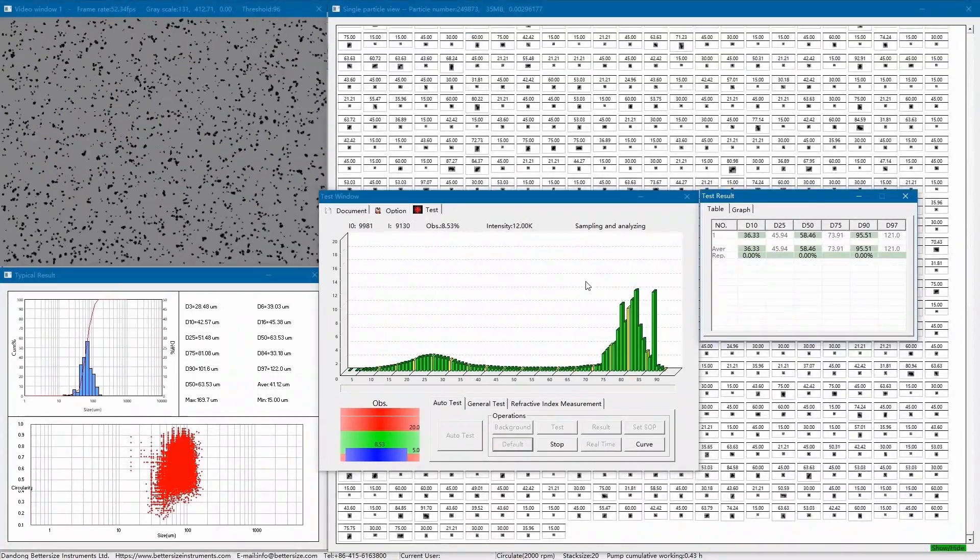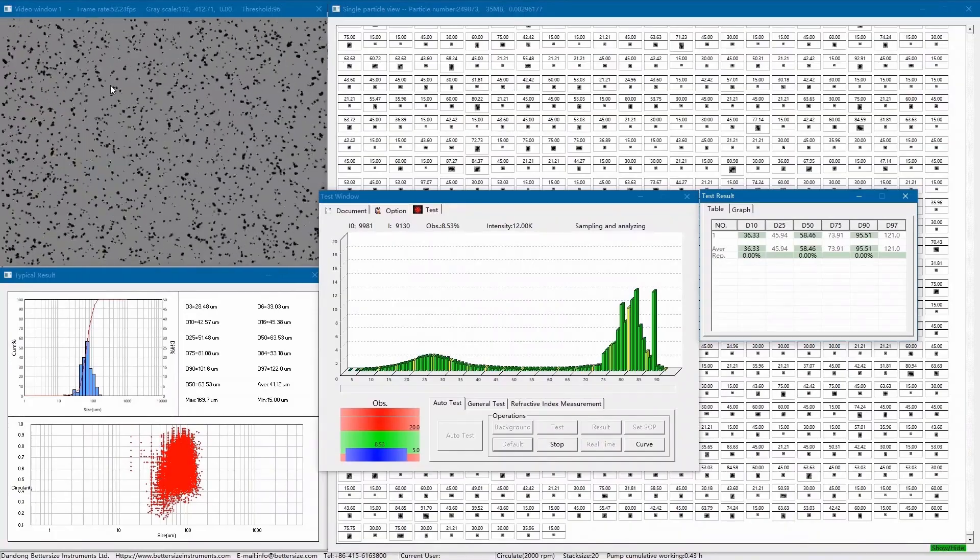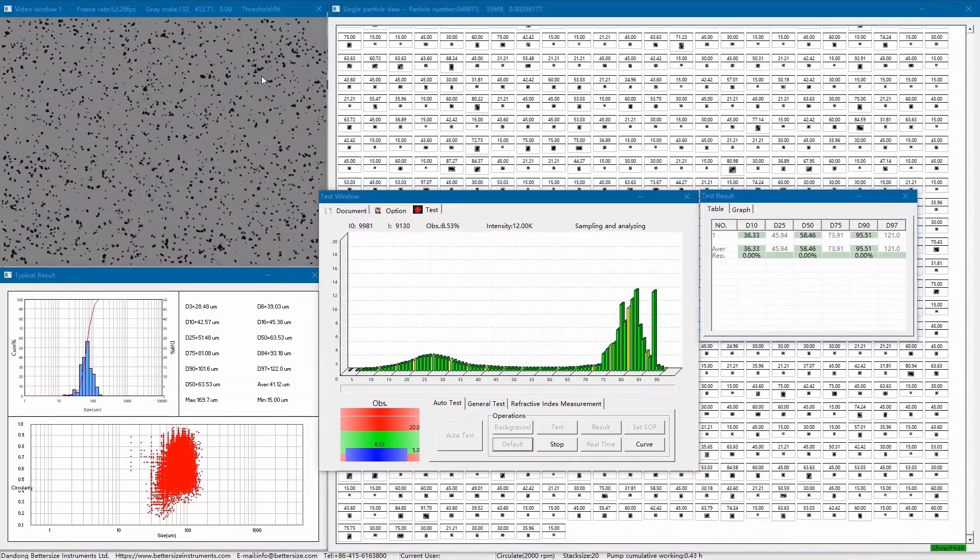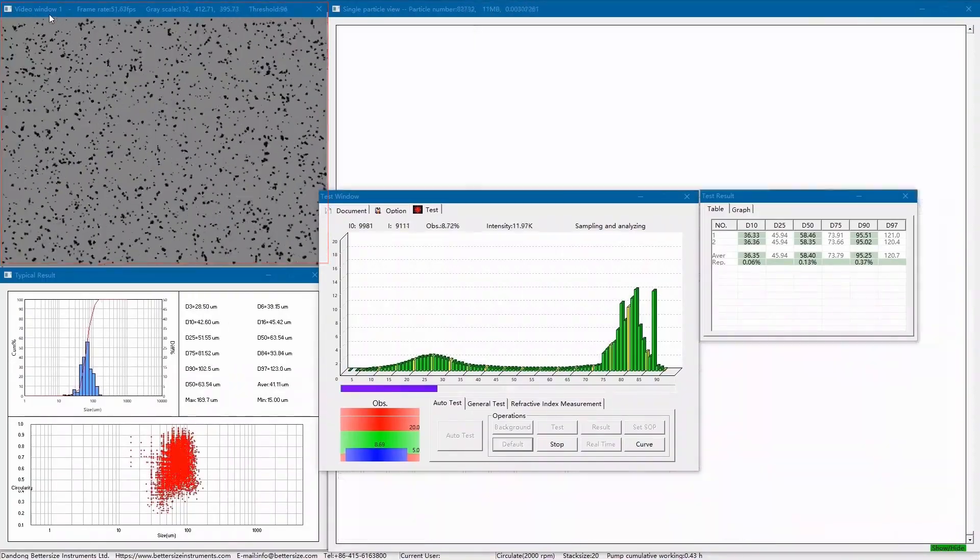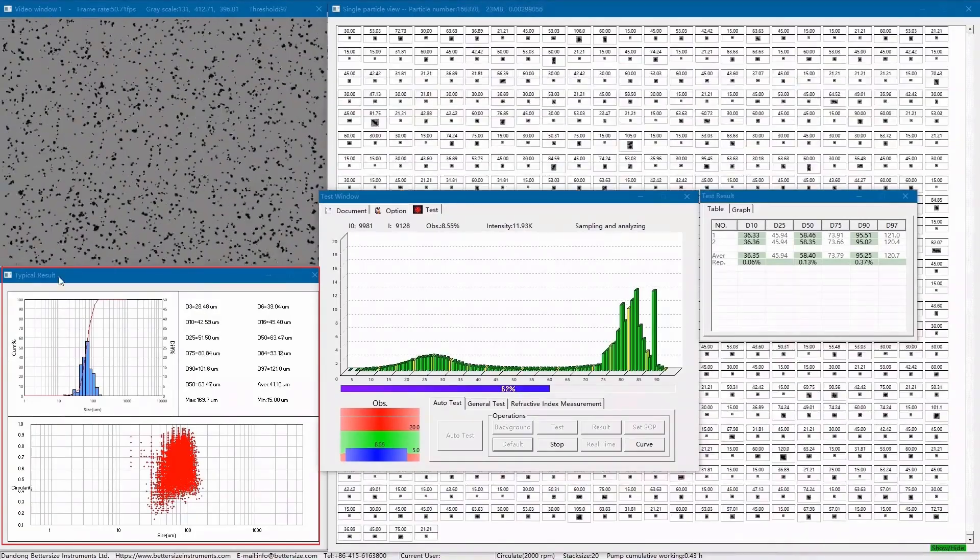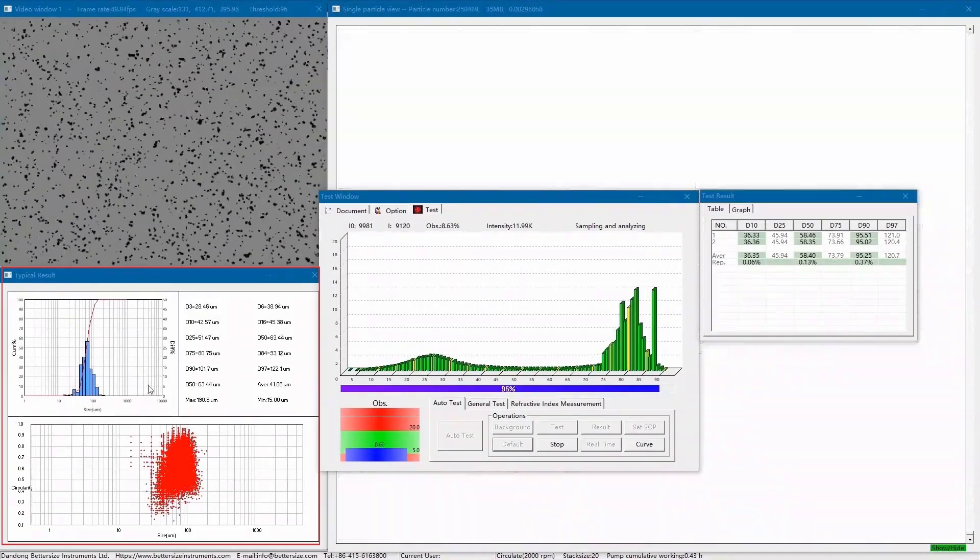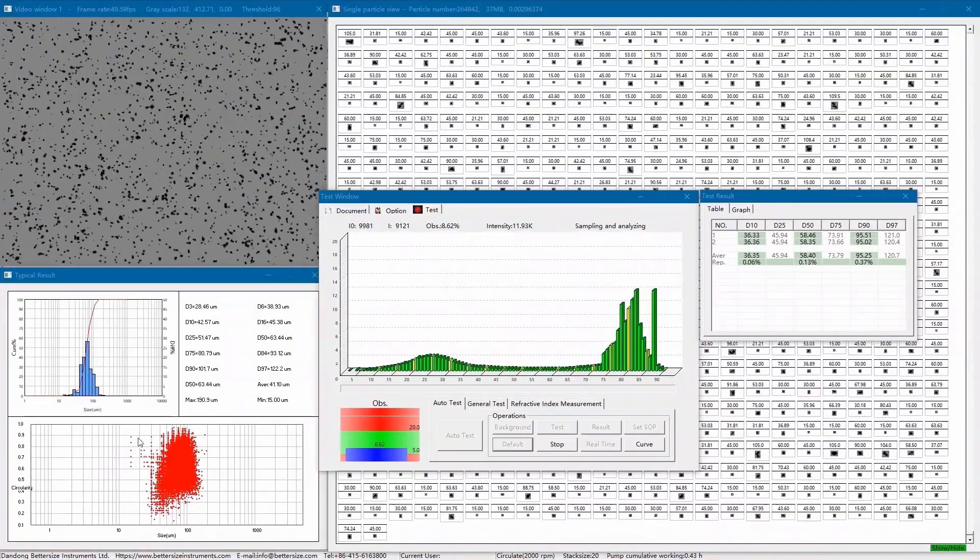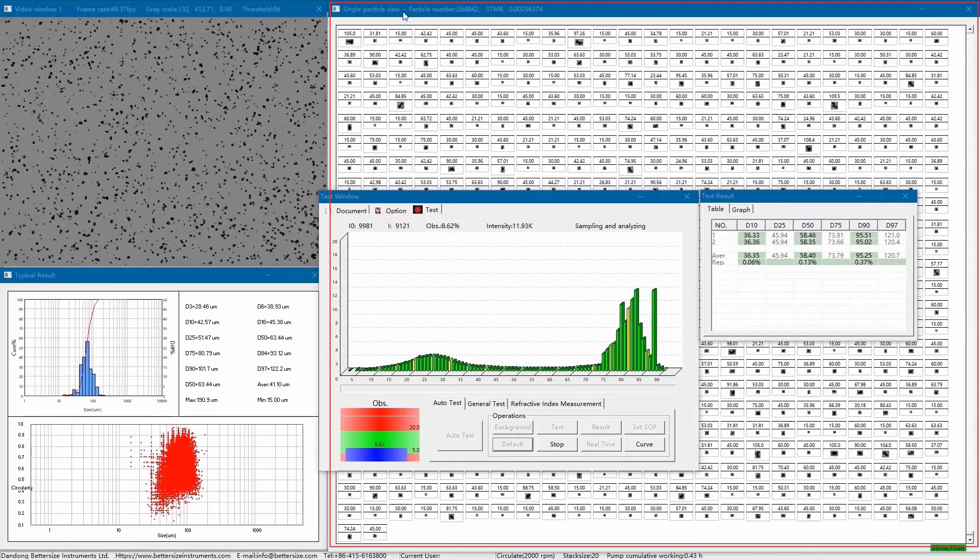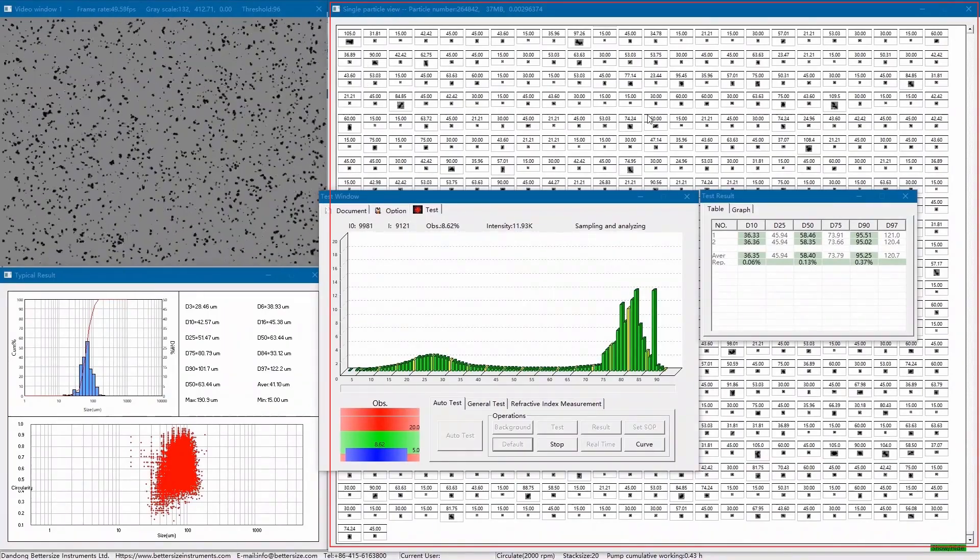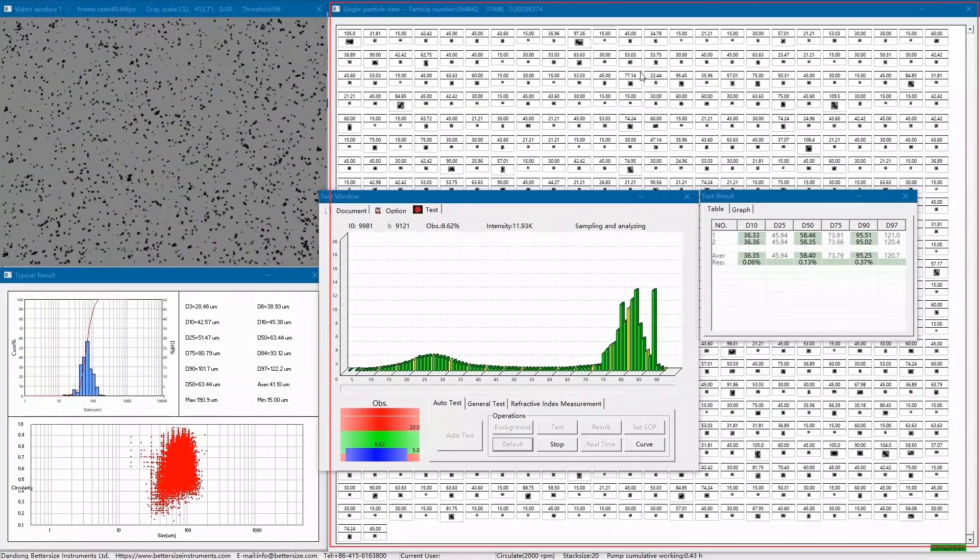On the other hand, other windows belong to another system, image analysis system of the Betasizer F3+. The upper left window is the real-time shooting video, and the lower left window is the real-time analysis result, including a histogram, typical values, and a scatter plot. And the right window is the individual particle image, which shows the image results. All the windows are provided by the image analysis technique.